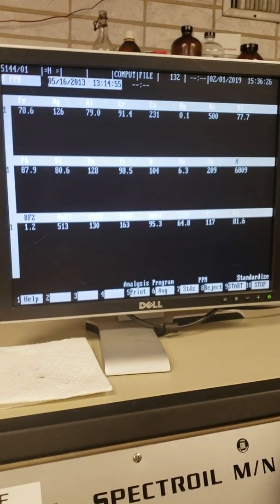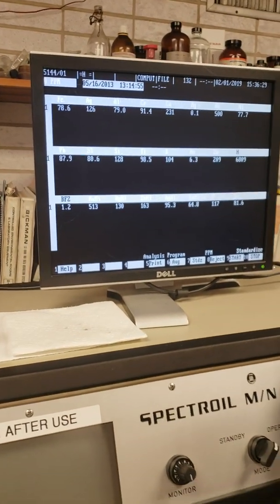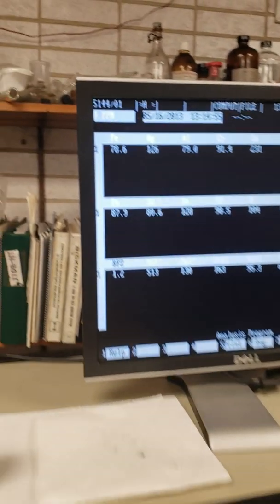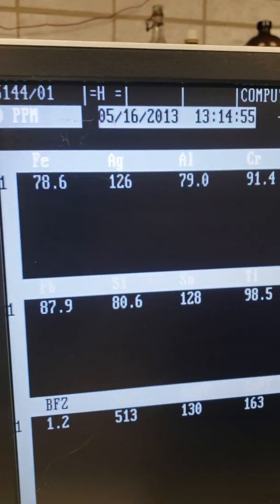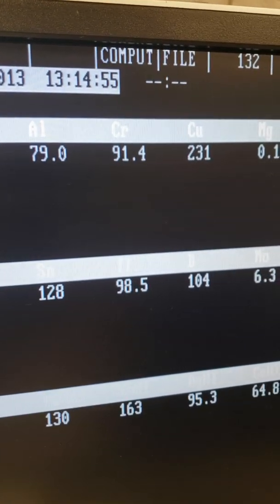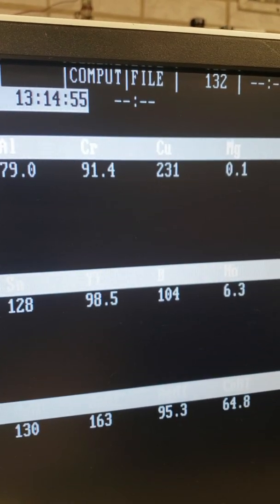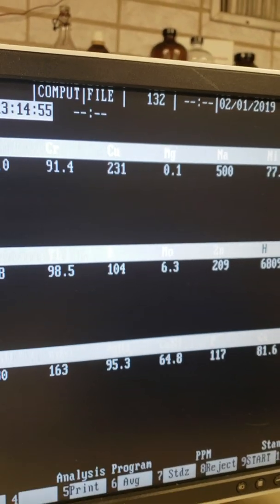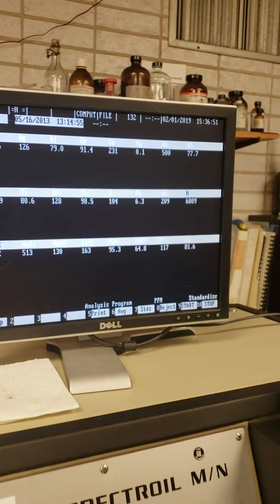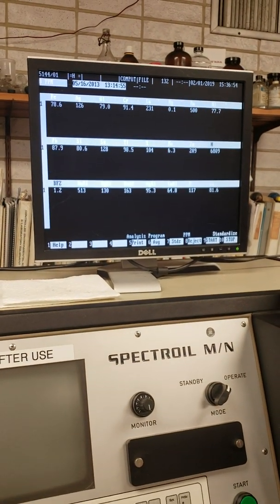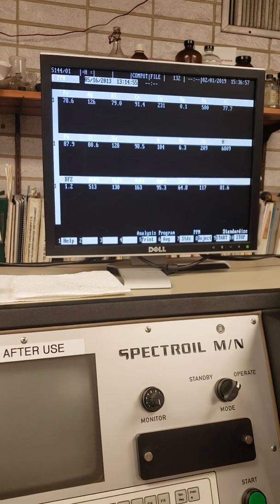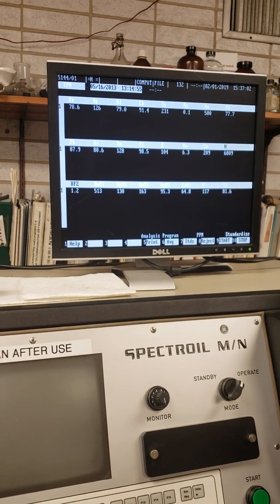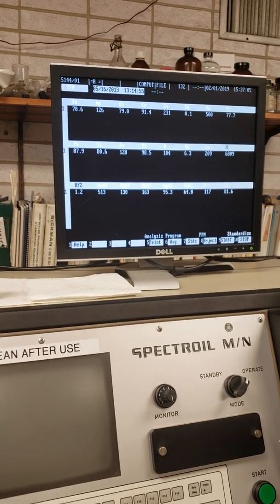There we go — here are our results. If you look across the line here, you've got 78 parts per million iron, 126 silver, 79 aluminum, 91.4 chromium, 231 copper, 0.1 magnesium, 77.7 nickel, 87.9 lead, and so on and so forth.